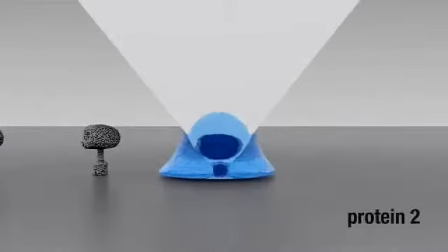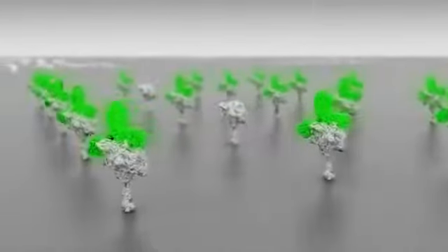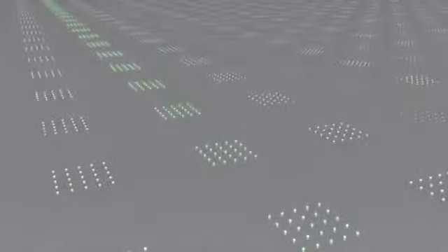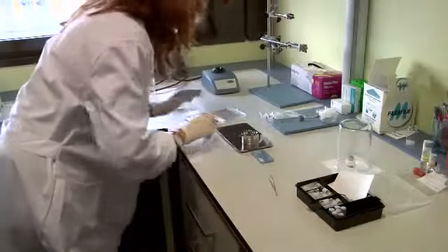What we really want to control is the number of entities that you are delivering on each dot of the array. With this ability, scientists could discover the interactions of substances on a unit level. For example, testing the interactions of single biomolecules. You can study the interaction between the virus and the cell, or answer the question of whether a single virus can infect one cell.